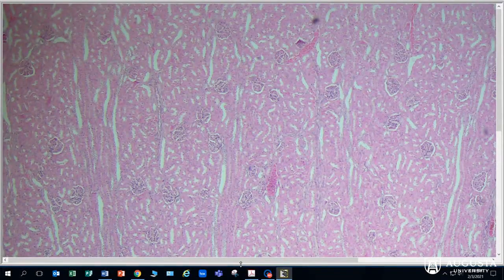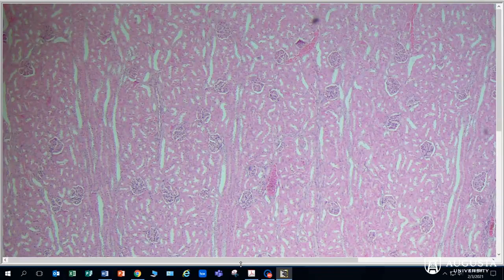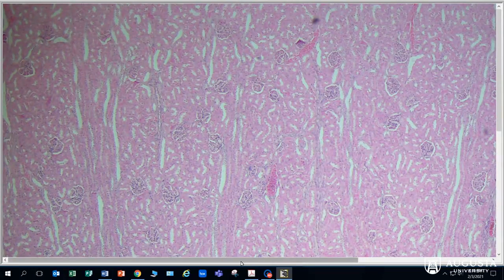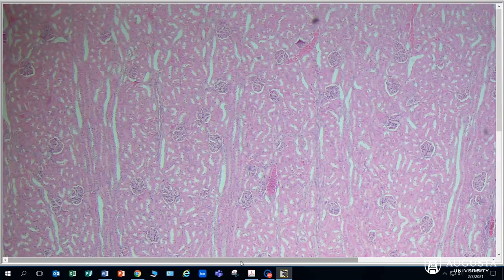In this video we are going to explain the simple squamous epithelium. This time we're going to look at the kidney. There's a different video looking at the simple squamous epithelium of the tissue of the lung.